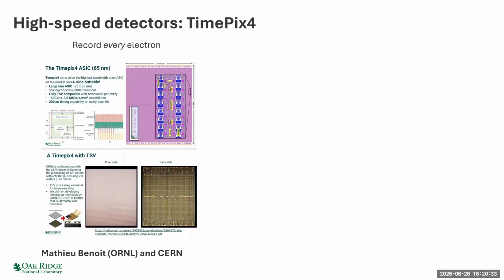Okay, so having seen that there's a lot more information in those recorded scattering distributions, maybe the next thing you want to do is go faster. So over at CERN, they've been developing these very high-speed detectors for tracking particles that come out of the various particle accelerators. And there's a new generation of those which are really well suited to electron microscopes because they're able to count fast enough that they can keep up with every electron in our beam. So, of course, that was how I generated that pattern that was building up at the start, by using one of these detectors in an electron microscope.